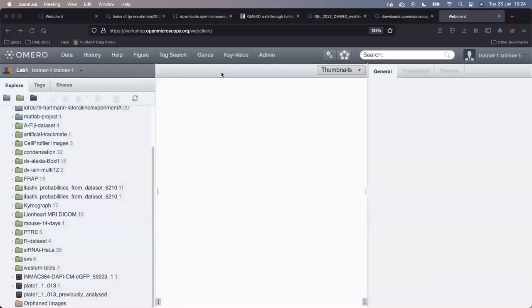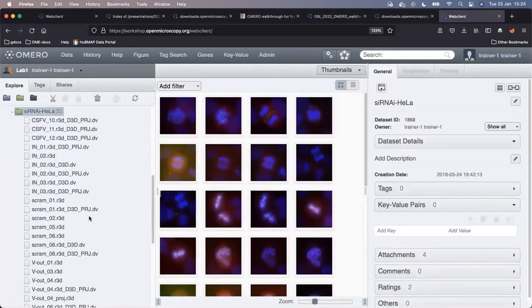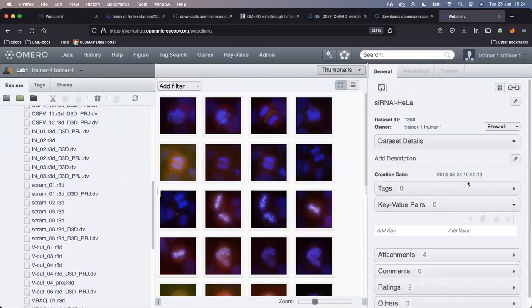The workshop continues now with the natural workflow we have in OMERO. After we imported the images, we want to view them, because what we saw up till now was just a preview, and we manipulated the rendering settings.